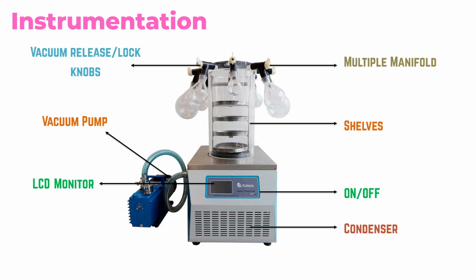There is also one point which is known as a drain point, from where we drain the excess water. It is used to remove excess water available in the chamber or the system. So this is all about the instrumentation.